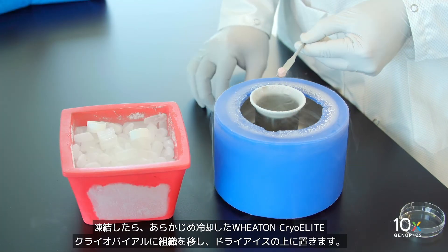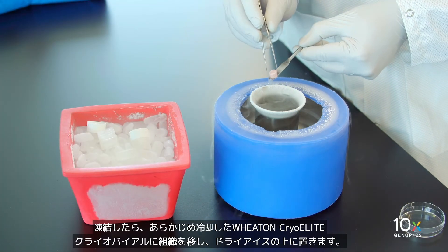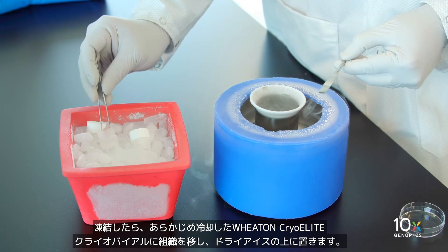Once frozen, transfer the tissue to a pre-cooled Wheaton cryo-elite cryovial and place on dry ice.